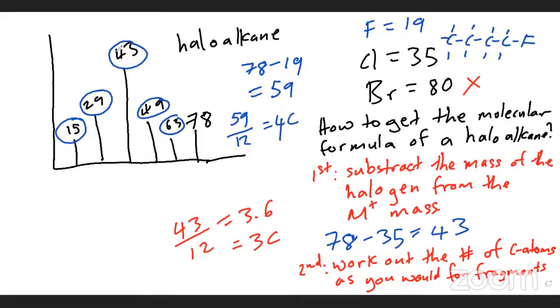They're always hydrocarbons, and the formulas are always fixed. So on any mass spectrum, 15 is always CH3, 29 is C2H5, this would be C3H7, all right? Now, after 43, the next one I gave you was 57, which is C4H9. The reason I'm telling you this is that any number outside of these will have an atom that does not make the compound a hydrocarbon. For the 15, 29, 43, 57, those fragments are for hydrocarbons.